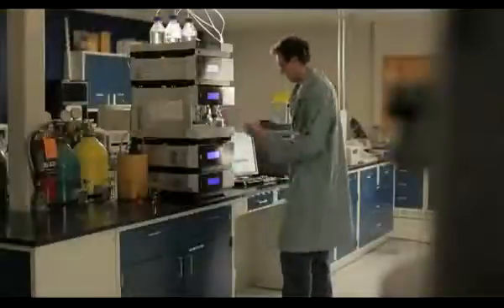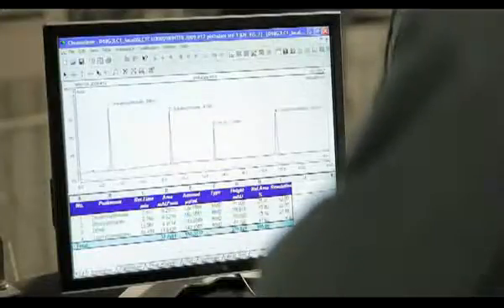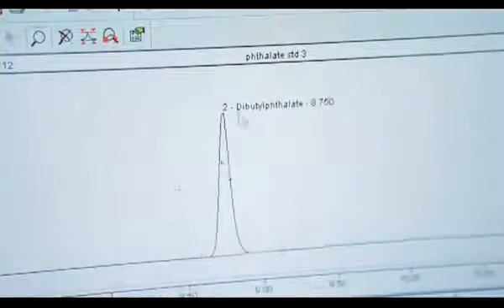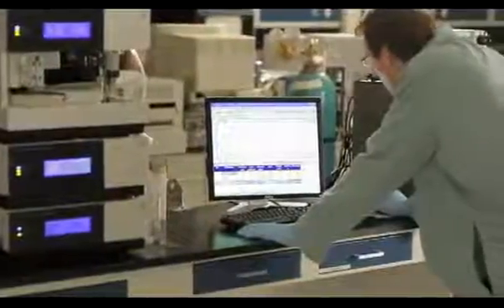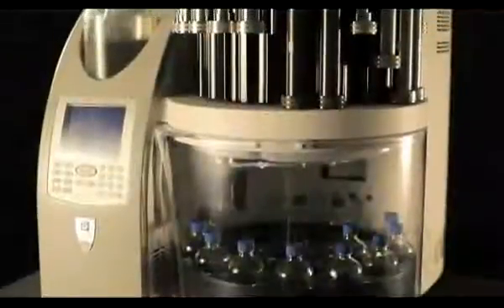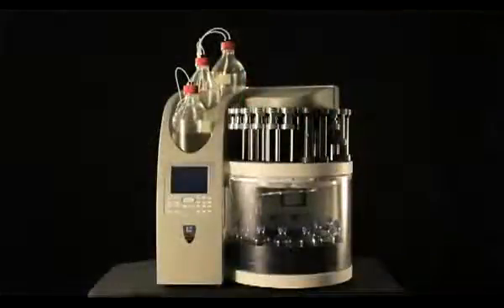This faster extraction time and significant reduction in solvent use boosts productivity and minimizes lab costs. This newfound efficiency will enable you to see a fast return on your investment in the Dionics system. In most cases, the ASE system pays for itself in two to three years. However, if your lab does a lot of extractions, it could pay for itself completely in less than one year.